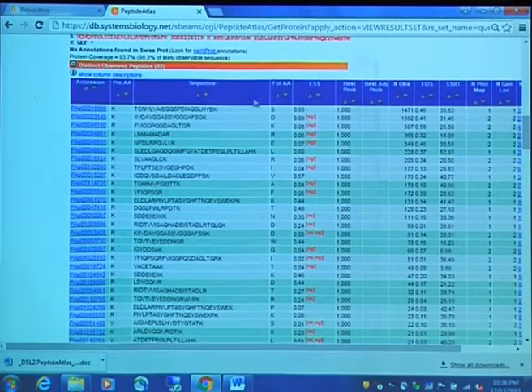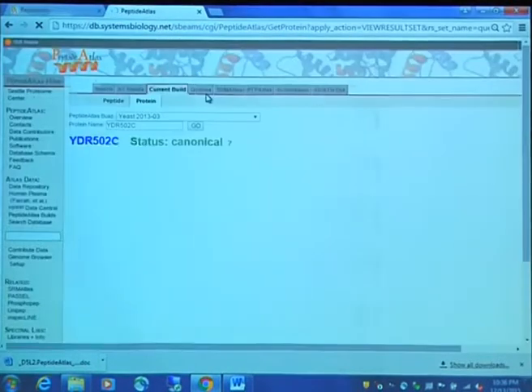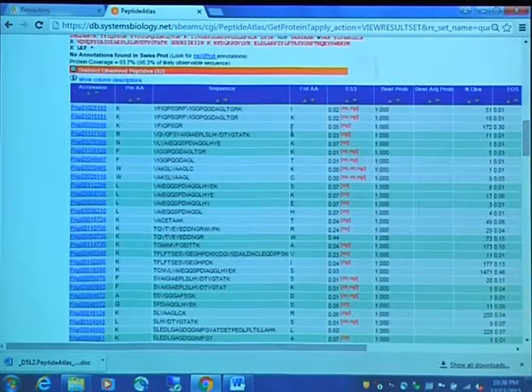So did you guys see what I did? I sorted by the number of observations. So these funny little triangles, as you've probably seen on other web pages, are a sorting mechanism. So I could sort alphabetically by peptide by clicking on the sequence. And that's going to give me the sequence sorted, descending, and unfortunately it doesn't take me right back down to the bottom of the page. So when you do that down arrow, that's a descending sort.